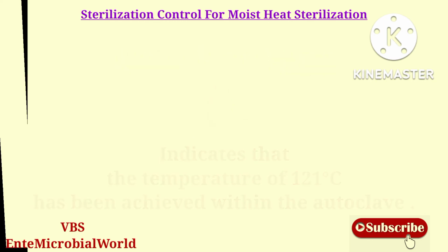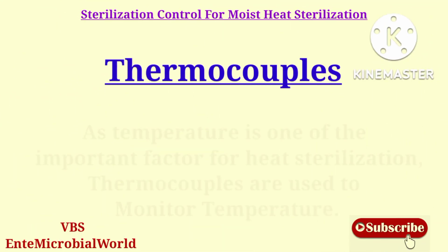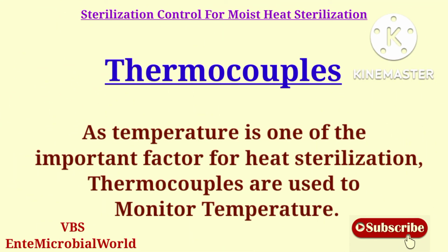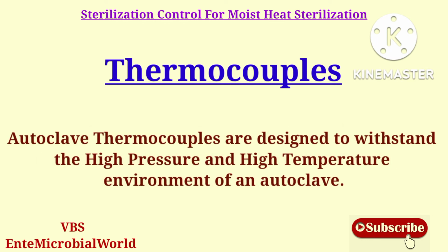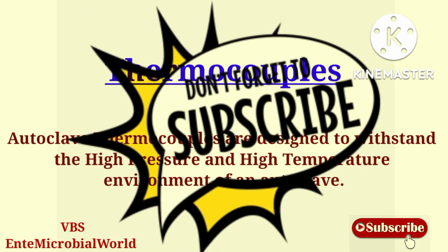Finally, we are going to see about thermocouples. As temperature is one of the important factors for sterilization, thermocouples are used to monitor temperature. Autoclave thermocouples are designed to withstand the high pressure and high temperature environment of an autoclave.